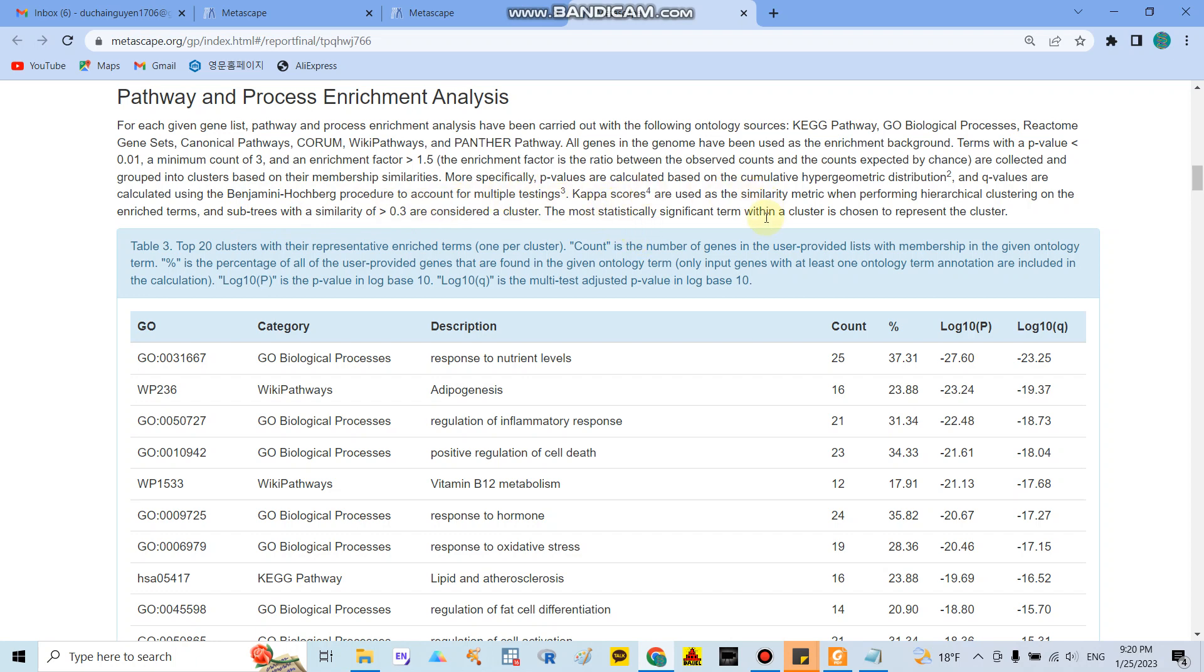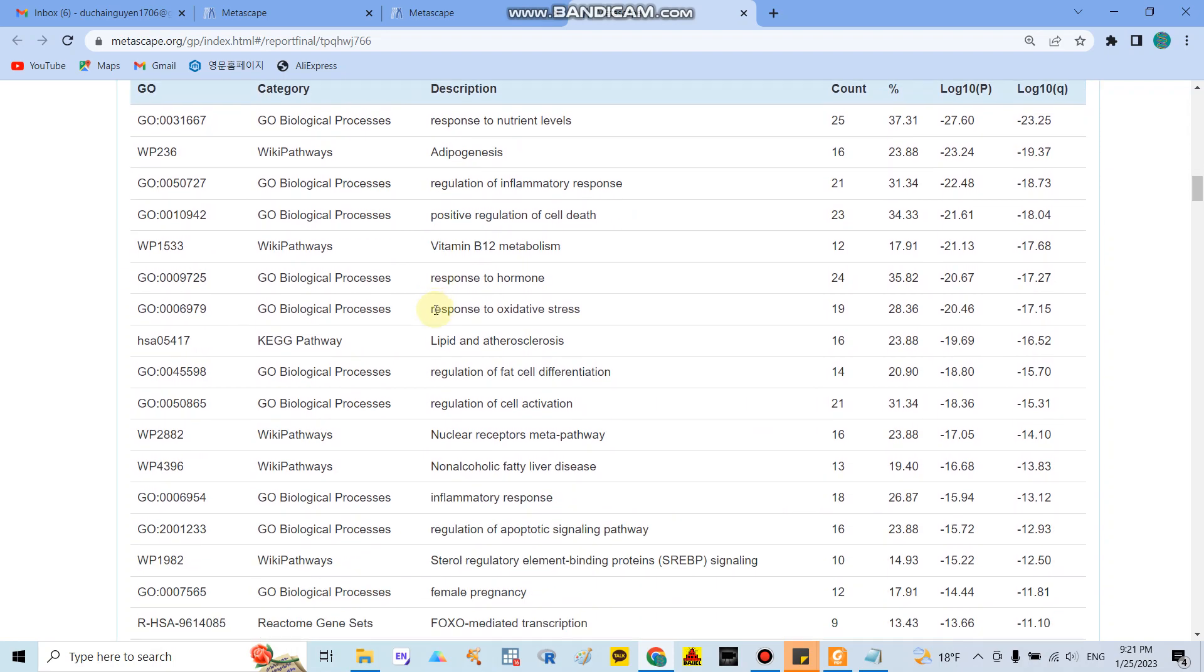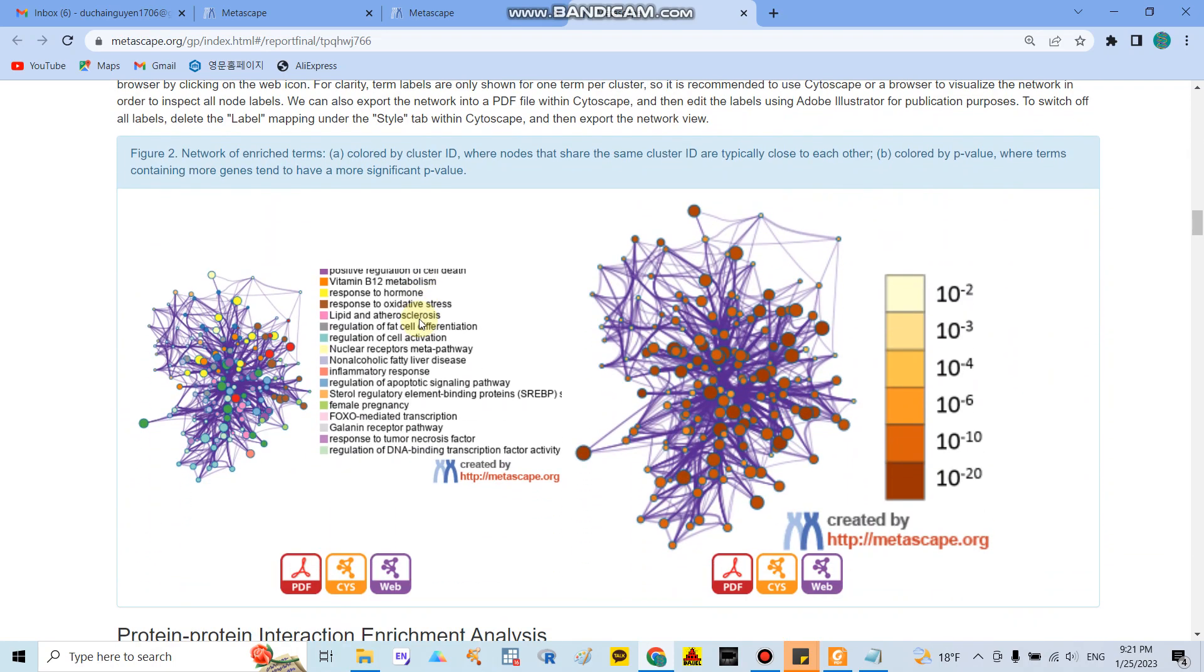And they use a lot of technique, for example they use the Benjamini Hochberg procedure to account the multiple test terms and they use the kappa score in the similarity matrix to and the sub-tree similarity over 0.3. In here if you use the cytoHubba, cytoHubba in this software I show in here, you need to set every item at the bottom to help to get the data. But here very convenient only one click and you can see a lot of results.